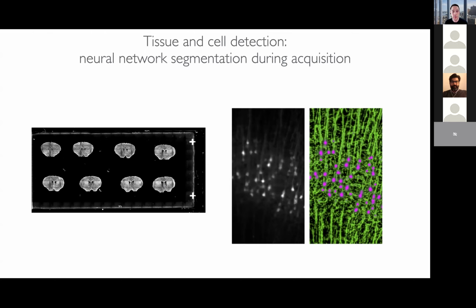But I think more importantly, we can also use these deep learning-based segmentation tools to detect the cells and axons and dendrites, and so that makes for a better and more reliable detection of those processes. But also, for people who are doing studies like looking at CFOS, where detecting those cells, especially in very dense environments, is very difficult, using deep learning can give a much better result.